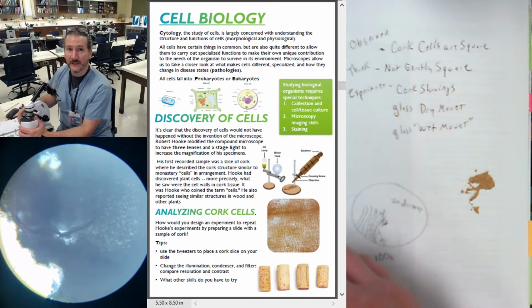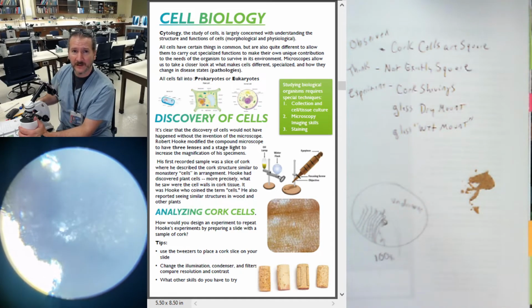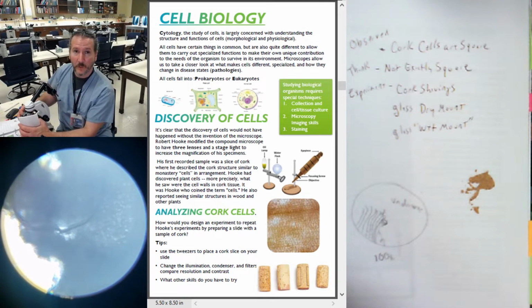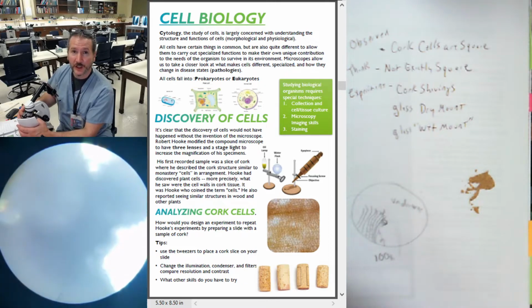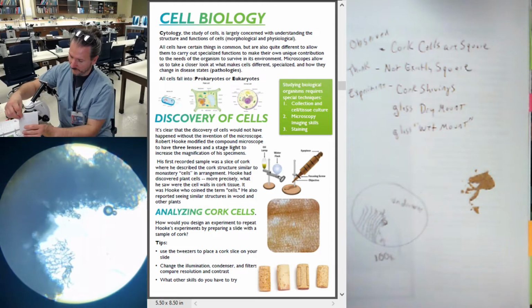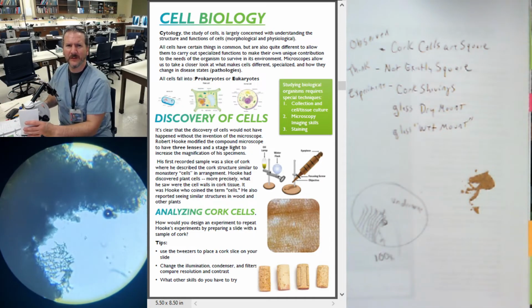Alright, I do believe my image was better without the water. Yeah, for sure. Oh, actually that's pretty cool right there.